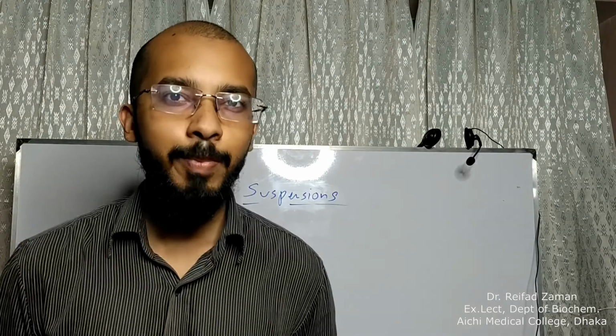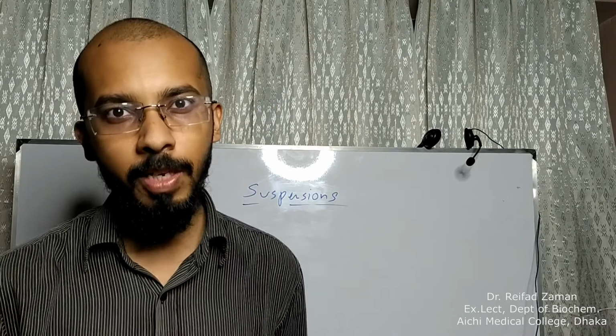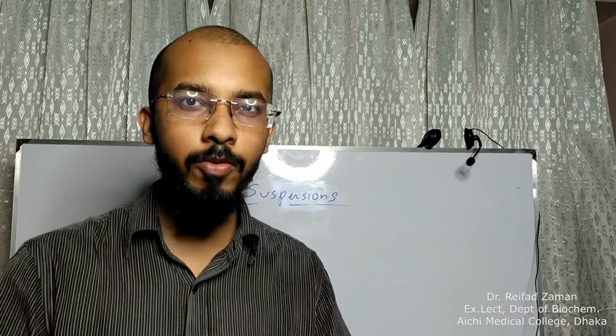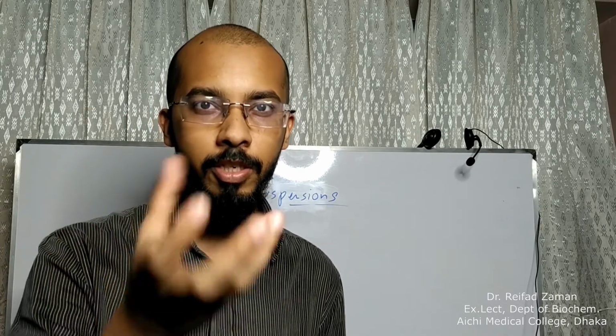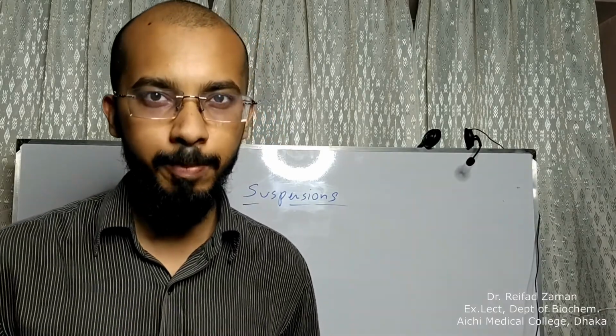Now let's come to suspensions. Suspensioner বেলায় সলিউট গুলা ইনসলিউবল হয়. তার মানে তুমি যতই চেষ্টা করো এই সলিউট গুলা কখনো সলভেন্টের মধ্যে ডিসলভ করবে না. They will always separate out. And তুমি যদি একটা সাসপেনশনকে ফিল্টার পেপারের মধ্যে দিয়ে পাস করতে যাও, the solids will be trapped within the filter paper. So let's make some suspension.